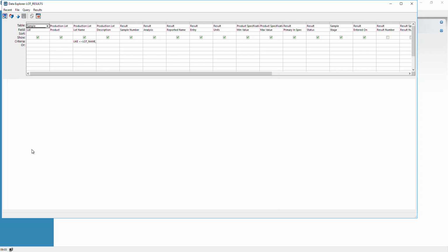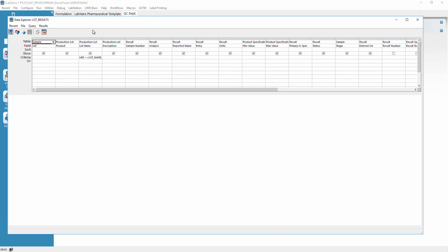And so this will allow you to pull all of the data for a particular lot as much as you'd like. And again, this is a locked report, so please don't play with any of the menu items. Don't save anything or anything like that. I don't want you to corrupt this. This is for kind of super users, and I've created these locked reports for some of the folks to get in there. If you're not comfortable with it, ask for some help and get some training. And again, don't save anything at this point.